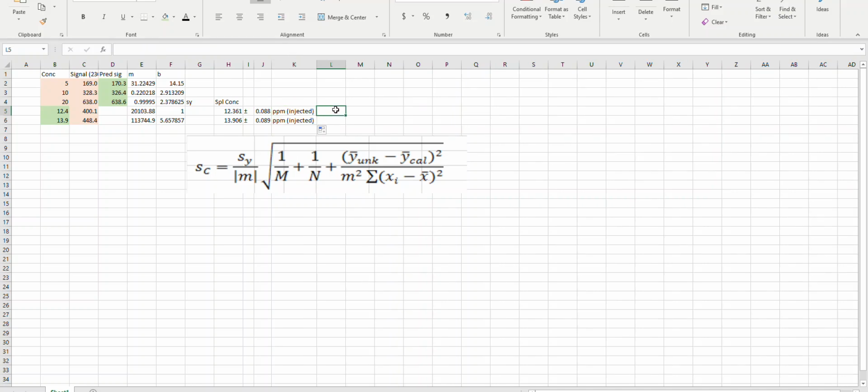Now what we need to do is convert this into ppm prepared, right? So now I'm going to make some example masses, and I'm assuming here that you used mass to dilute the samples. This is where you took a little bit of Diet Coke and about 10 times as much water and pipetted them into a vial and you weighed them.